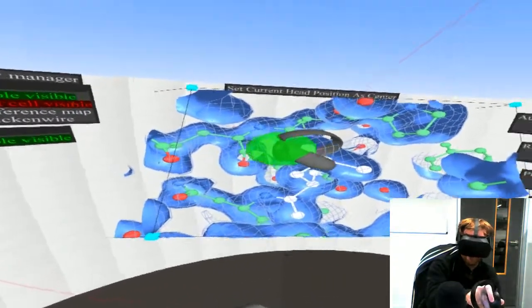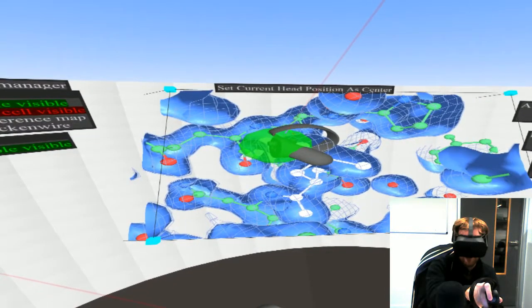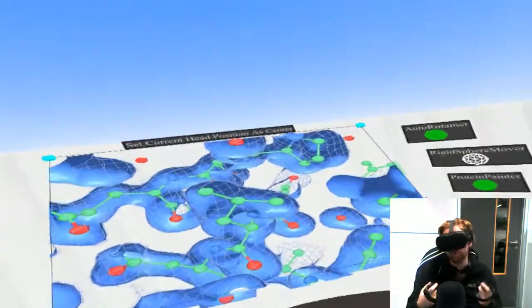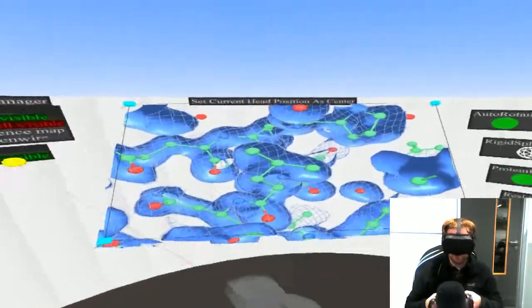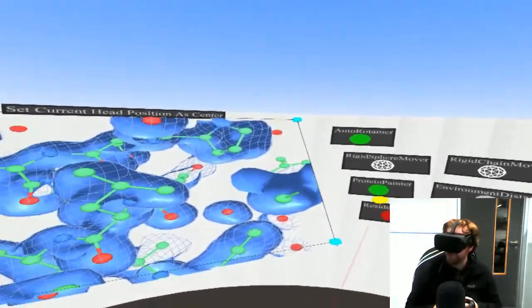But one thing that you might want to do is to do this, for example. Sorry, when you don't have a speaker in front of you. See, there was a slight change in the position there. That's this tool that's running on my computer, and so it got that set of positions out of the Rotamer library.